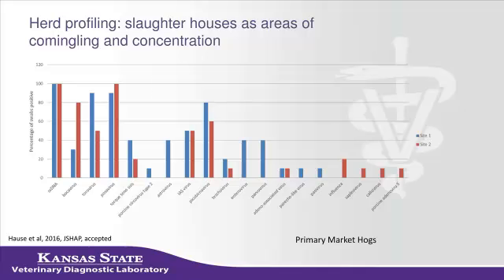So what viruses are present? We looked at two sites, which were, I guess, primary market sites. So healthy, normal pigs going to slaughter. So these are all the viruses we found. And again, it's not surprising. We find lots of parvoviruses and torque teno, circoviruses, a bunch of random viruses. Nothing too exciting on this list.